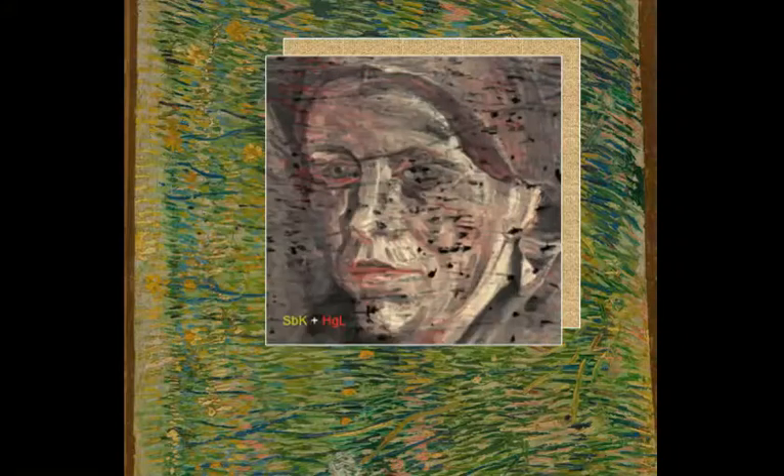Zinc white, for instance, was mostly used in the surface painting, as you can see here by the horizontal striping, as were a number of other pigments such as barium sulfate. Behind that surface painting, we then find a rather uniform distribution of lead, which is the secondary priming layer that van Gogh applied on top of his hidden head. And if we take away that primer, we get a nice detailed view of the hidden face. This image was made by combining two elemental distribution images of mercury and antimony, and we colorized those two distributions according to the color that the pigment would have had. That gives us a beautiful colorized view of the hidden face.